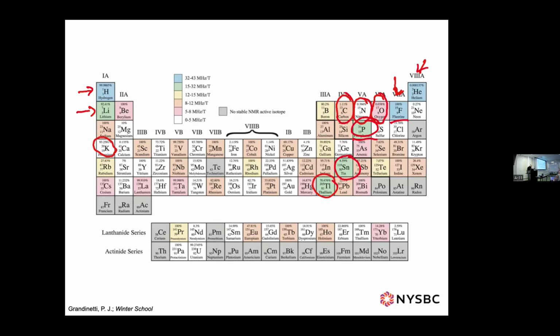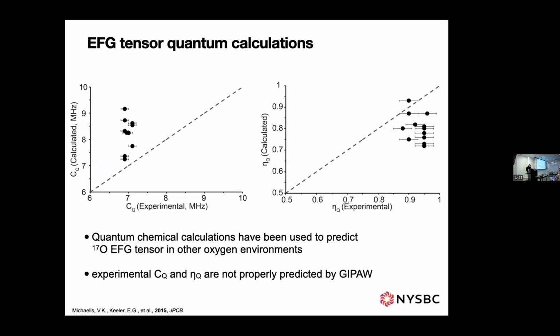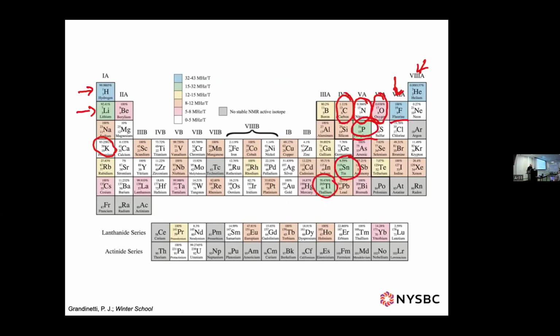Okay, so that was just a couple of things from what we talked about yesterday that had come up. I should have included the slide before this. To remind you, we had ended yesterday with the results I had found in bound waters of oxygen-17. These are direct detect experiments. Nisha was asking about directly detecting the oxygen-17 of the water.